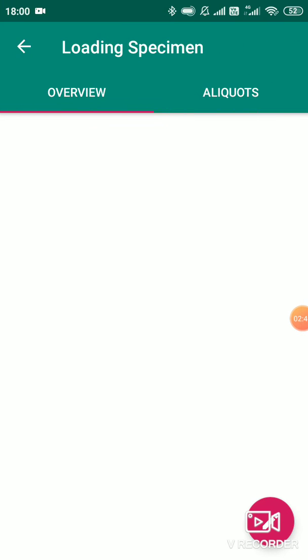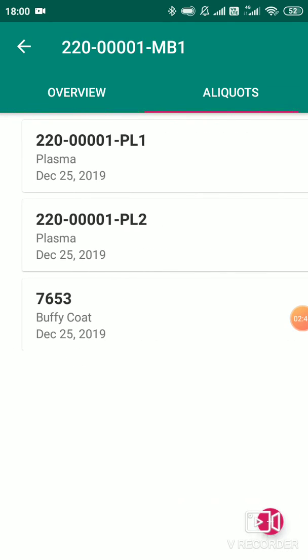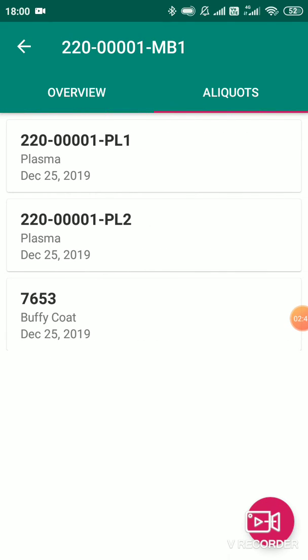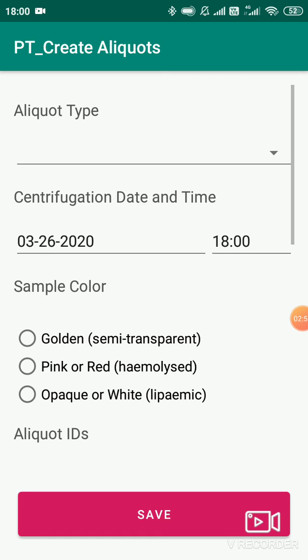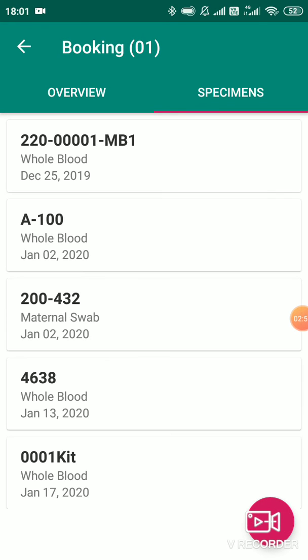Inside the specimens, once you collect the primary specimens, just swipe right and you can see the aliquots — the child specimens. Similarly, you can click on the plus sign, do the data entry, click save, and the data will get saved.